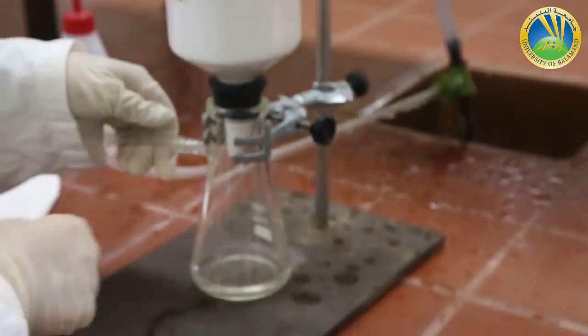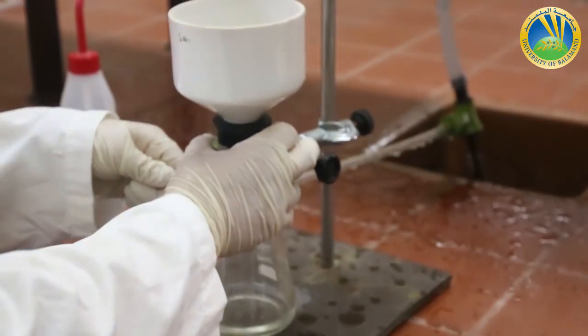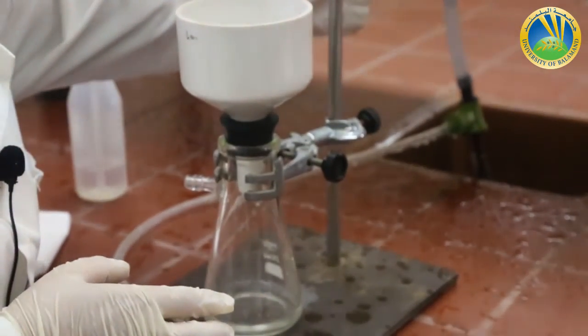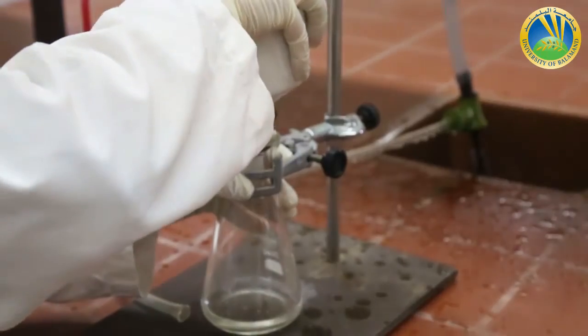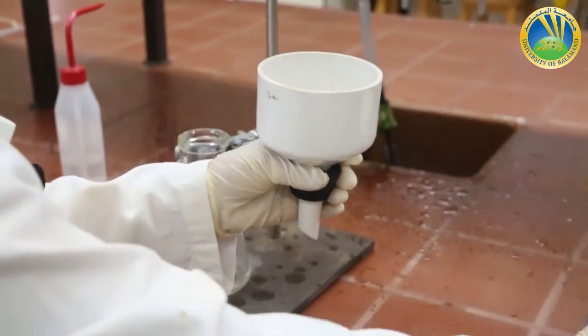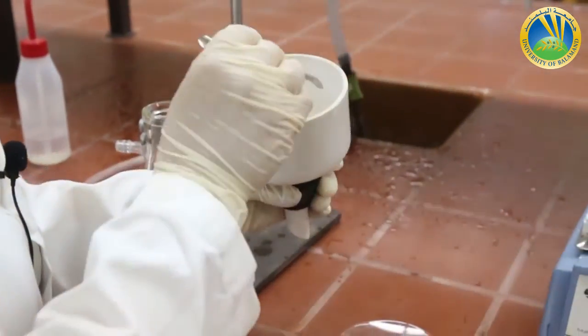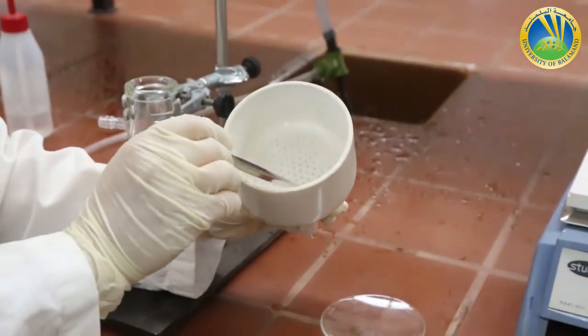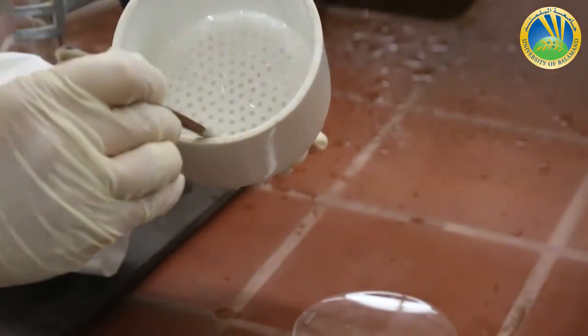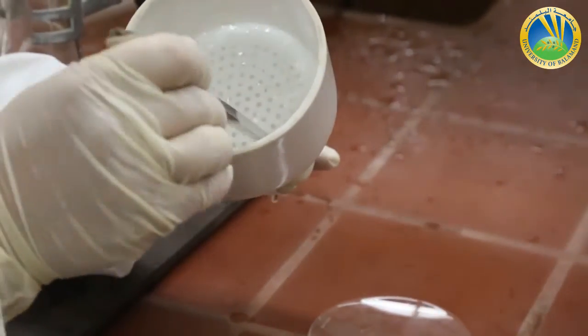To stop the vacuum filtration, I have to disconnect the vacuum hose and turn the water off. I remove the funnel of the Buchner and try to get the filter paper with the crystals with a spatula.